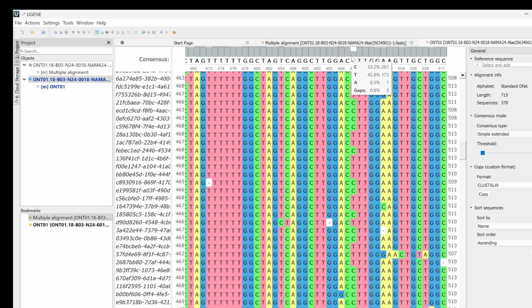And that's because 53% C, if I put it at that threshold, it's going to call it a C. Does that make sense? In the other direction, I can keep moving it up, 90, 93. Oop, now suddenly we got things changing.